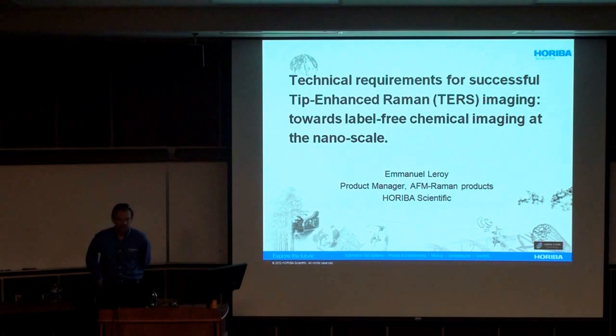And like Bill just mentioned a minute ago, there's a lot more push these days to add more spectroscopy to the microscope. And in this case here, we're talking about the scanning probe microscope and spectroscopy. So I'll mostly go over what we've been working on and what we've done to make the technique work better.